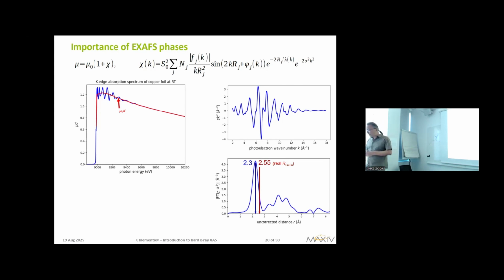So then, first, why does it happen? Well, it happens because of this phi function, the scattering phase. The linear part of it modifies the distance r. And what is also quite trivial is that this function is always negative. So the shift is always towards smaller distance.